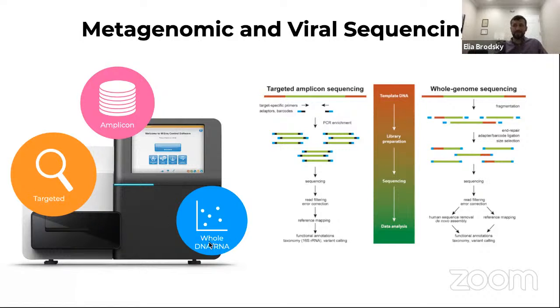When we talk about whole DNA and RNA sequencing, this is a completely different approach that produces different types of data that allow us to try to reassemble what is in the data, either by mapping on a particular set of references and looking at abundances, or trying to understand what novel information might be there that we are not capturing from a reference database, but still could be assembled based on an assembly of longer and longer pieces of genetic information because of the way that we observe that those pieces connected together in a number of different reads. So we'll talk about that in just a second.